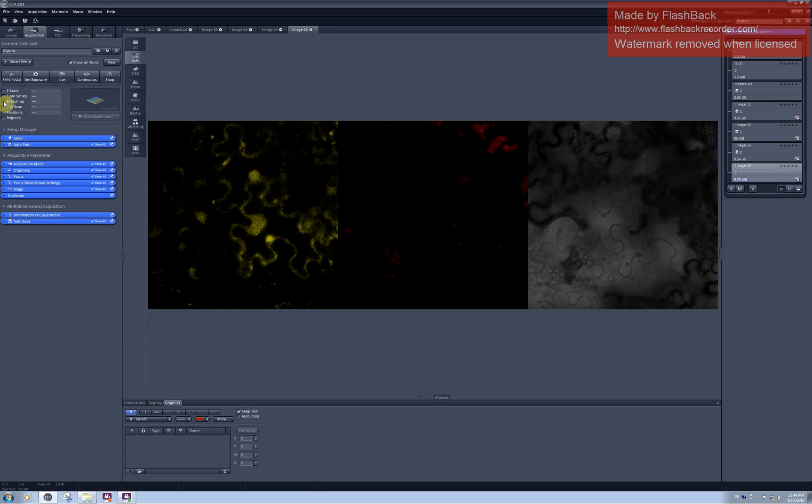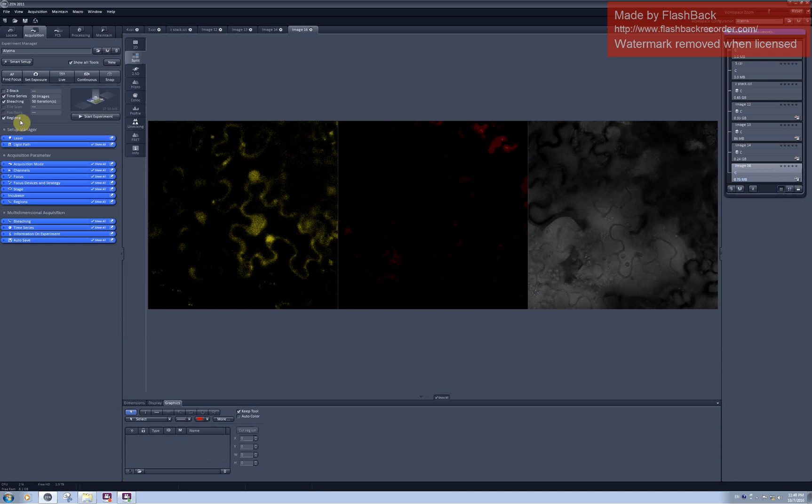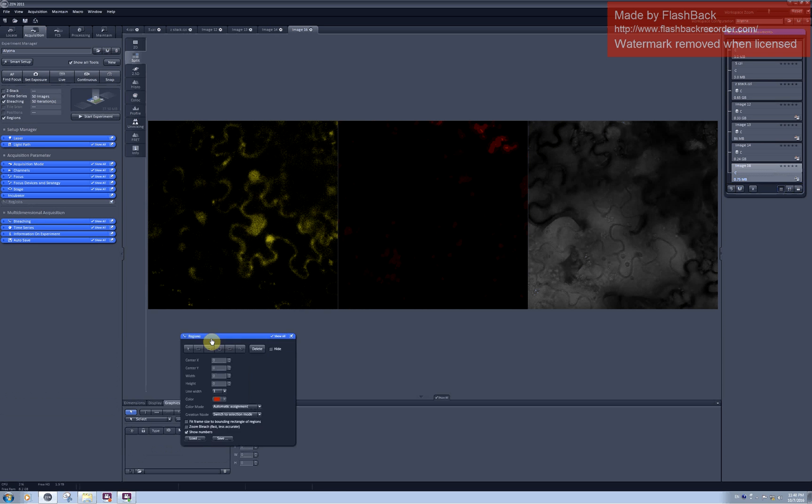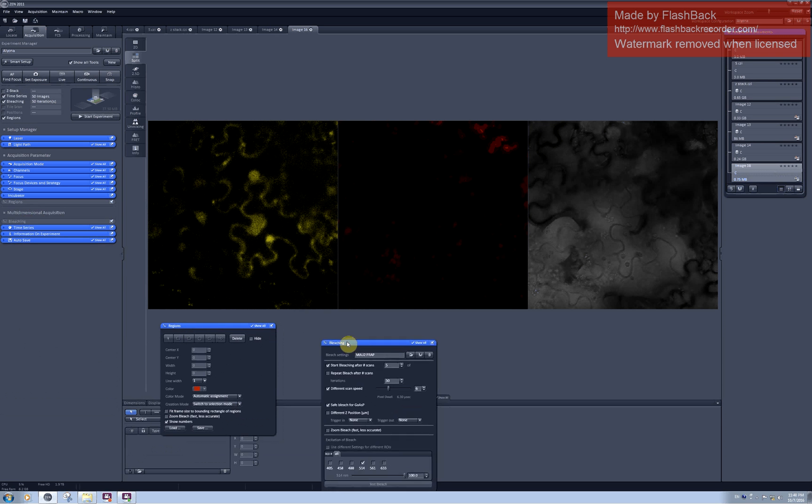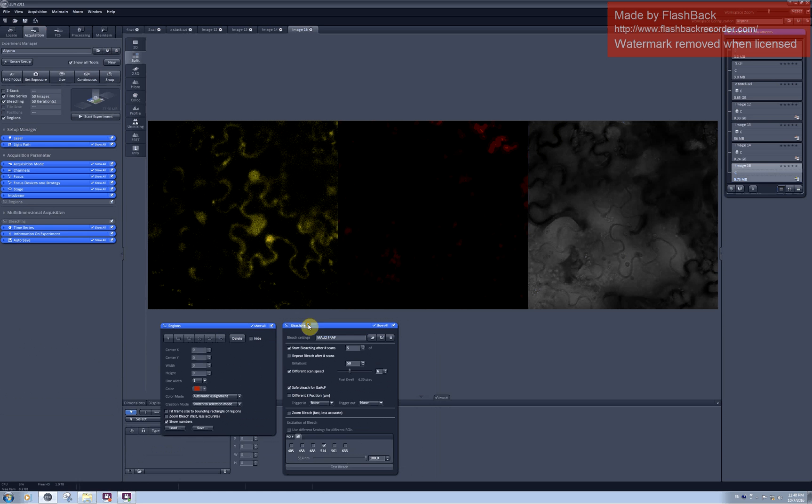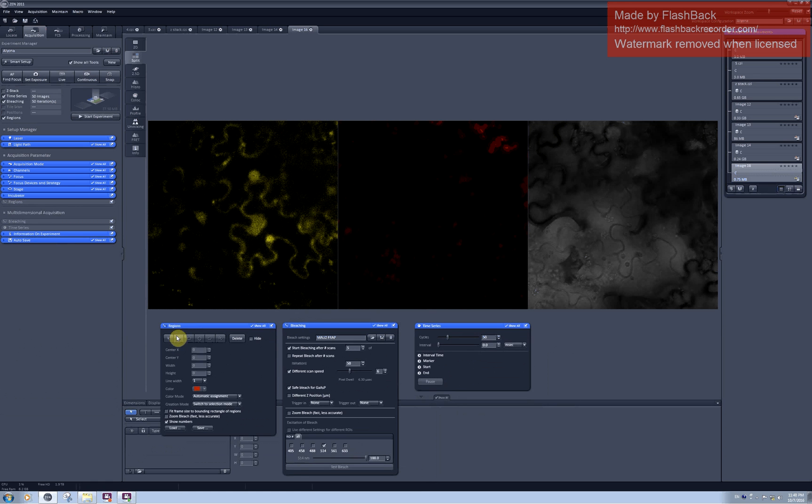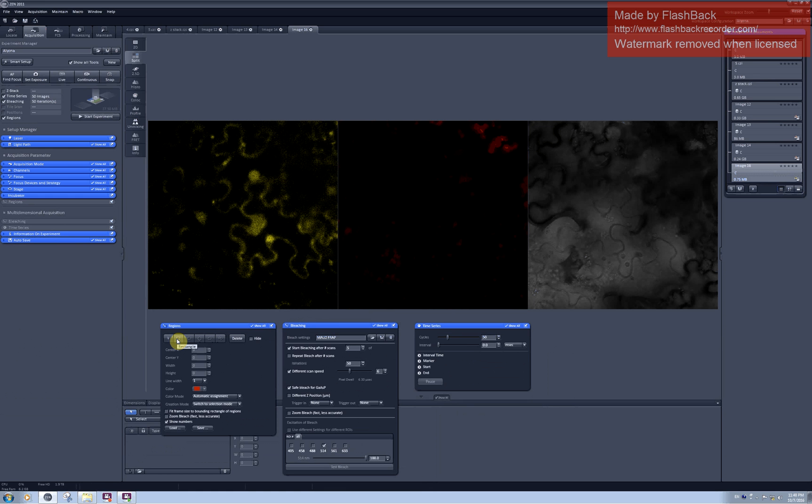First I need to activate the bleaching by clicking here. And you can see that two other options become automatically active. And I will pull them out here. Regions, bleaching and time series. The regions menu allows me to select regions I would like to photobleach and the regions I would like to analyze.